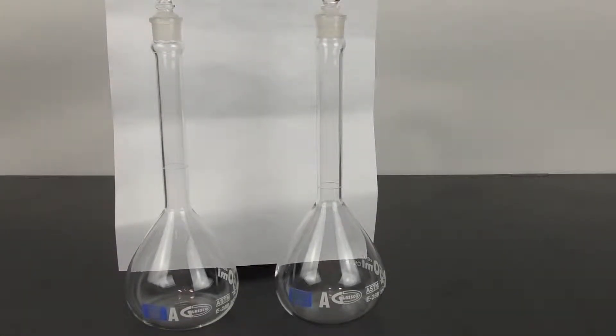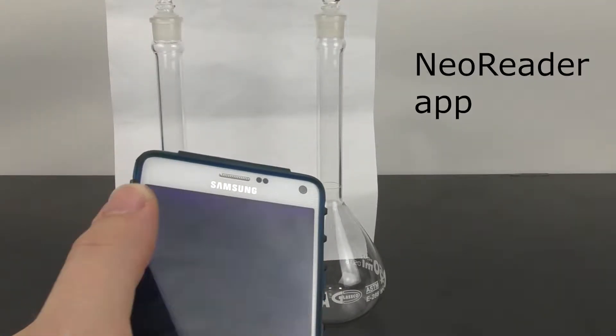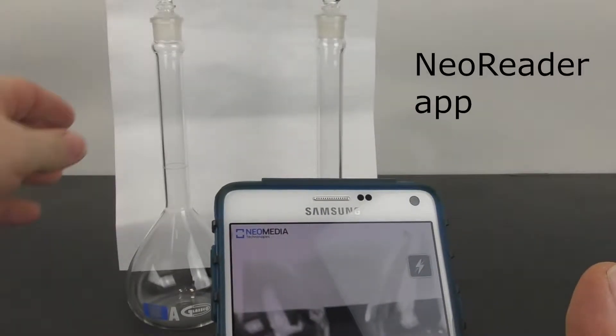Now let's go over how to actually use the app. You want to use the NeoReader app, and you want to have a white background so the camera can easily pick up the QR code.